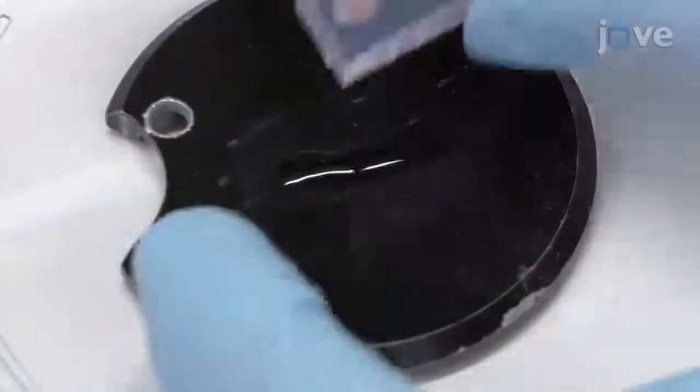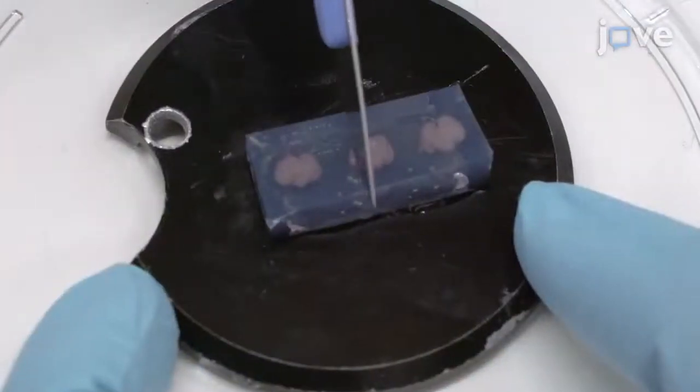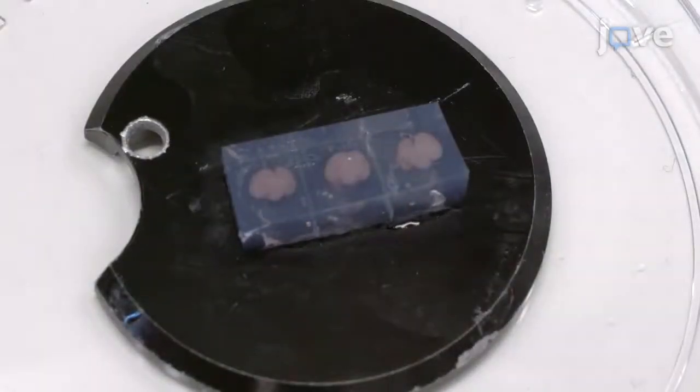Glue the block on the surface of a microtome base, and use a surgical blade to cut all the way through the bottom of the block between each tissue sample to obtain 3 independent blocks.